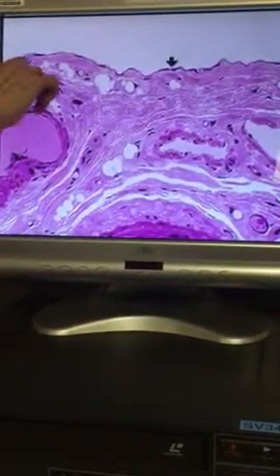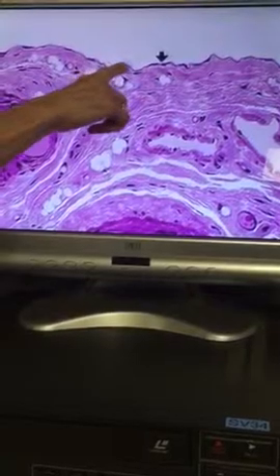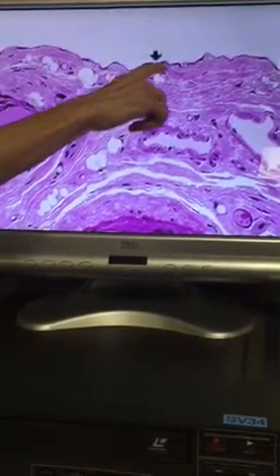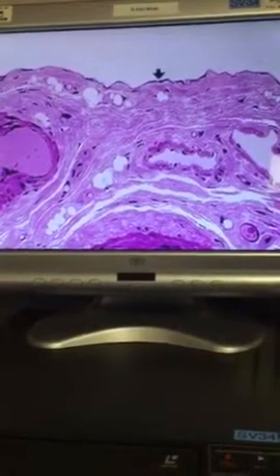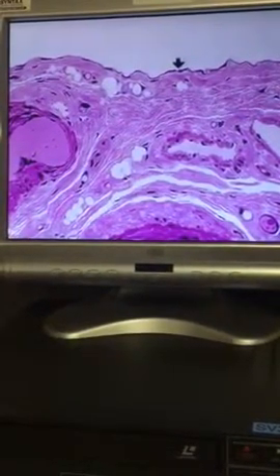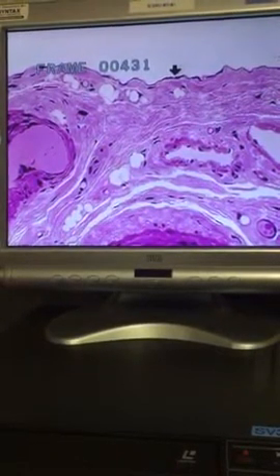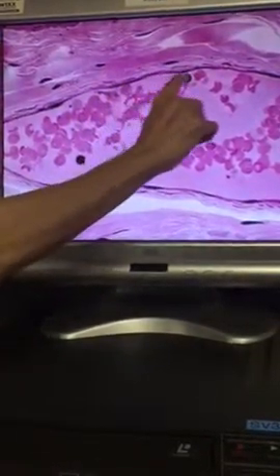And so again, notice how thin it is. So this is covering an organ that happens to be covered by a serous membrane. So this is our simple squamous epithelium. So it's a little tricky to identify this tissue at first. That's why I always like to have you guys identify it in the wall of a blood vessel. And that helps you, it gives you a little bit of a clue, because hopefully you'll recognize this is a blood vessel. Okay, and then you'll know that that's simple squamous.